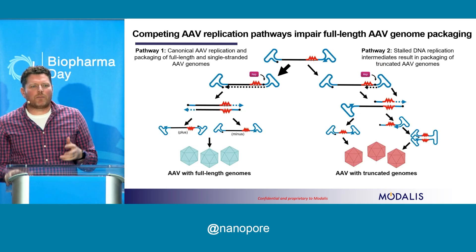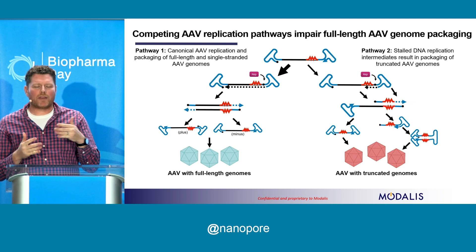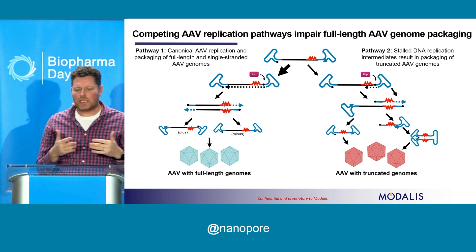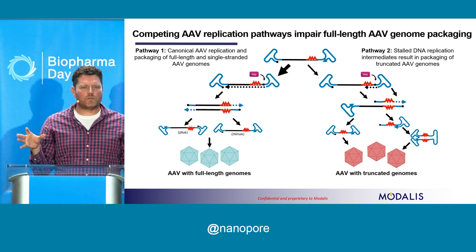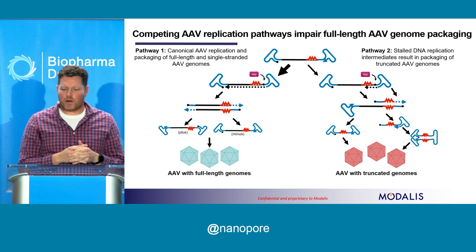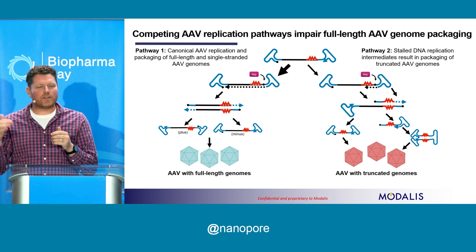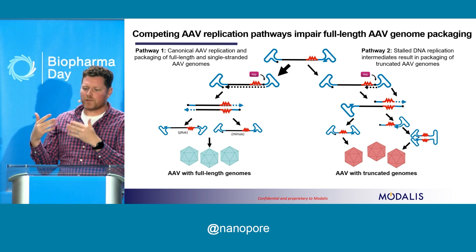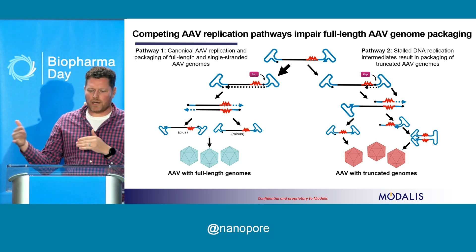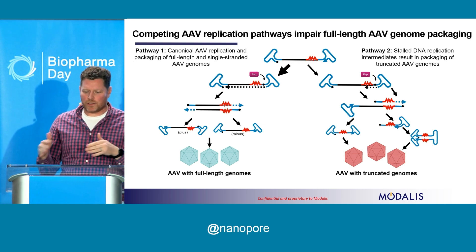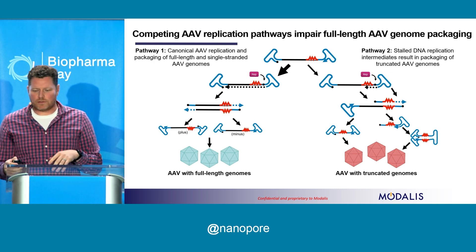When we saw this, we developed a model for future studies. We think we're seeing reduced yield because there are two competing pathways. In the canonical AAV replication pathway, the ITR is extended, producing plus and minus full-length genomes that are packaged into functional AAV particles. On the other hand, when you have problematic sequences, replication stalls at those sequences, resulting in truncated genomes. These truncated genomes can pick up an ITR from another AAV genome and are packaged into non-functional AAV. You end up with a mixed population of functional and non-functional AAV.